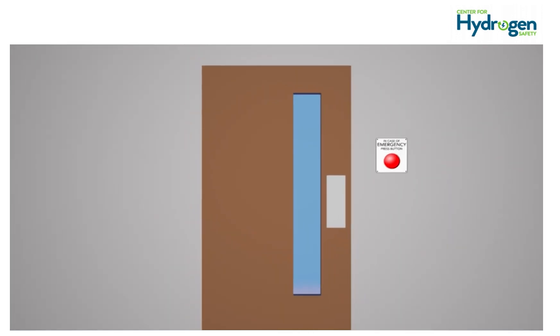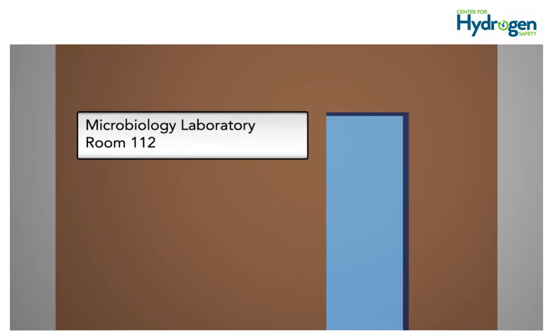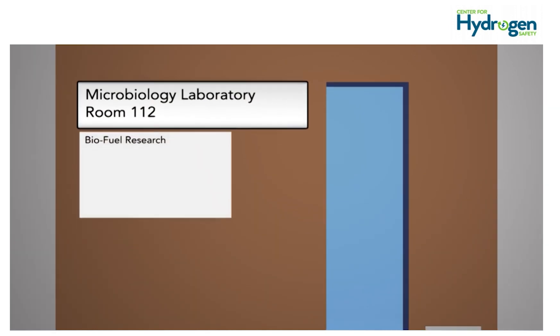The following information should be posted at the entrance and exits of any workspace where hydrogen is used or stored, in clear view of all who enter: the name of the workspace and room number, and the activity being conducted.